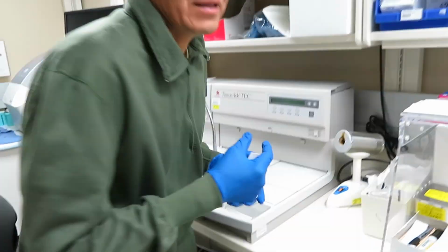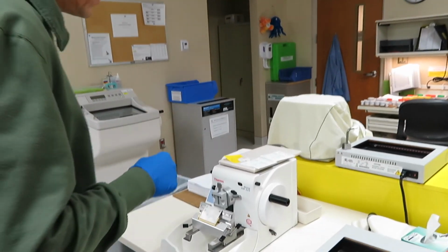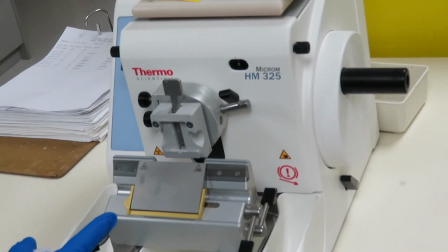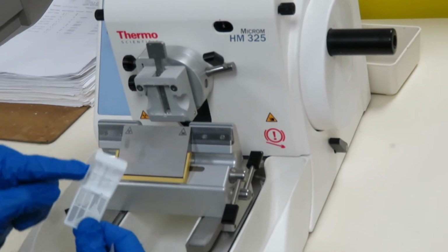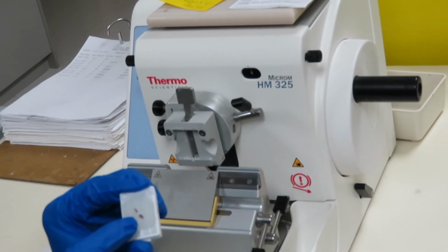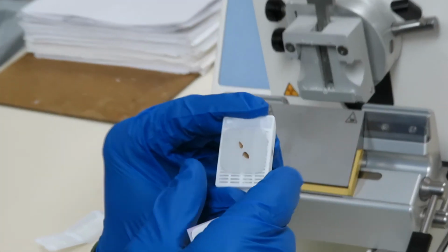Then what happens is they get this tissue block, and they come over here to the microtome here. This isn't exactly what they put in there, but this is what the tissue block would look like. So there's a piece of tissue in there, the tissue that we cut up, and the block, and this is really flat.